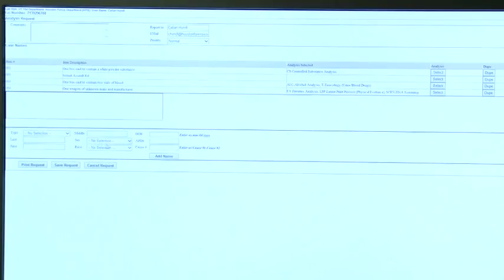We have a suspect in this case that may or may not have touched the gun. How do we get his fingerprints compared to any possible fingerprints found in this case? You have the option of adding comments in this page. You can put here his FBI number, his HPD number, or his state ID number. We prefer not to have any suspect name information. All we do at the Houston Forensic Science Center is science.